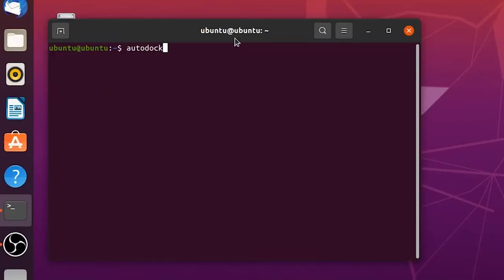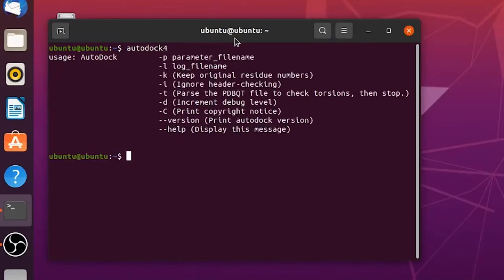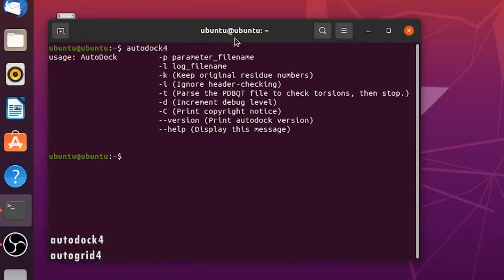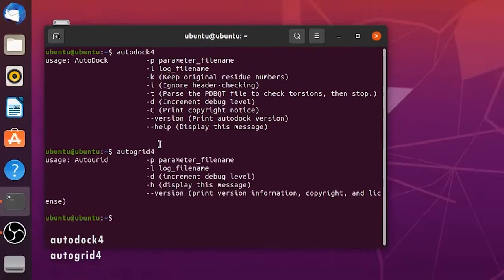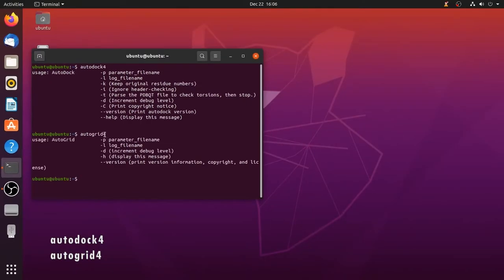To check the installation of Autodock, in the same terminal type autodock 4 and press enter. It will show the help commands for Autodock 4. In the same way check installation of Autogrid 4. In the same terminal type autogrid 4 and press enter. It will show the help commands for Autogrid 4. Now the installation is verified.